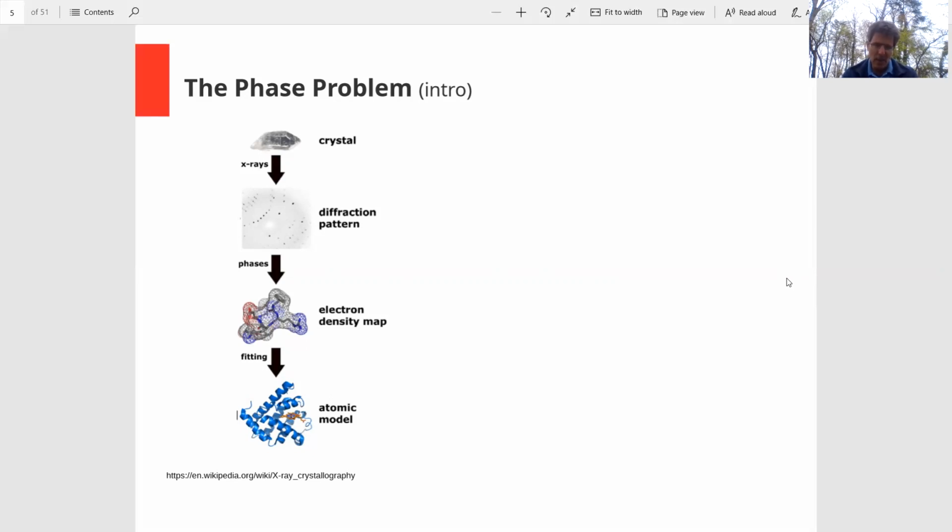And you can then collect the intensity information from each of those little rays from the diffraction pattern. The way I think of it is the crystal is in the path of the X-ray beam, and then you get this disco ball, where these small X-ray beams are coming out in all directions. And that's a diffraction pattern.